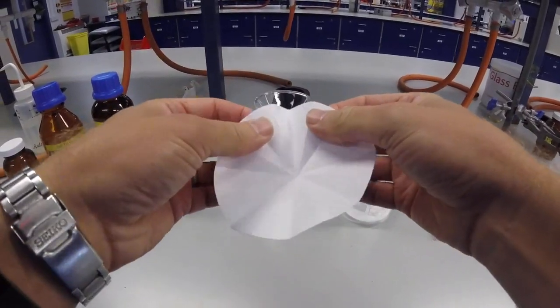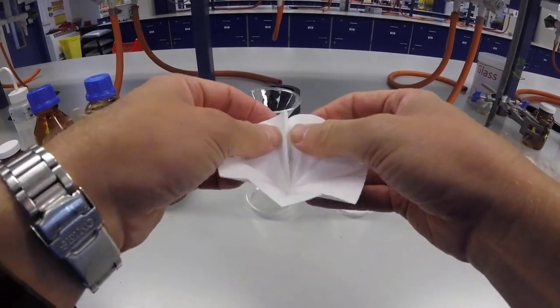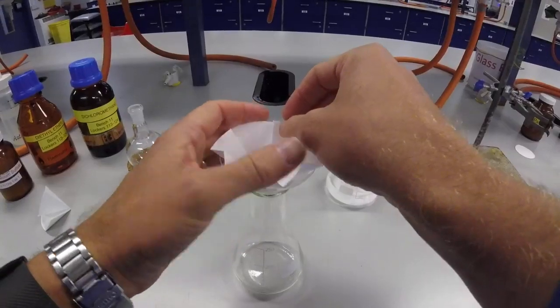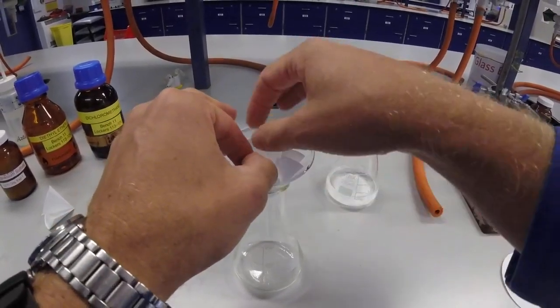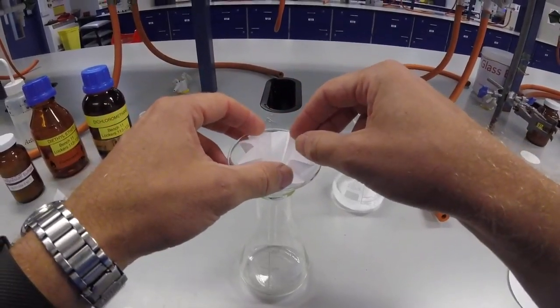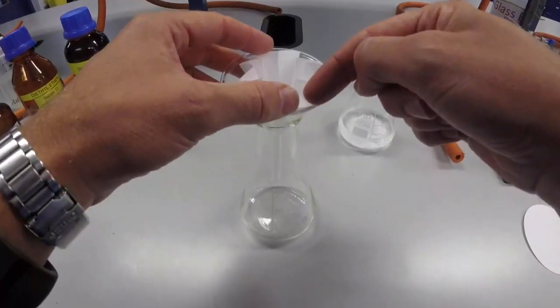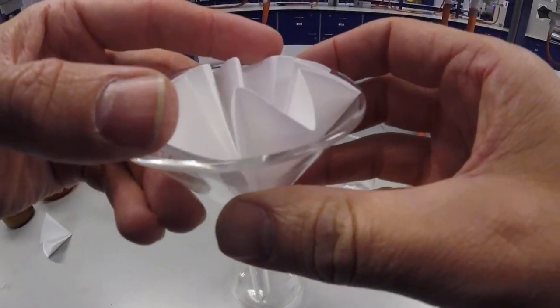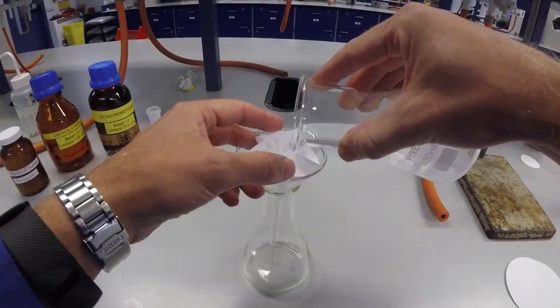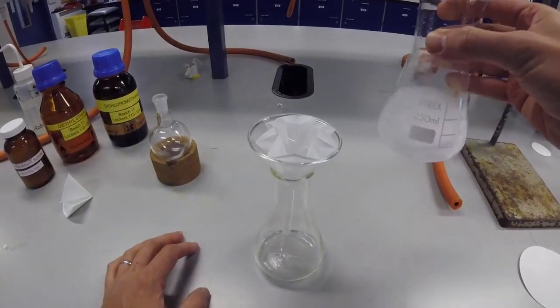And so now all our folds are going in opposite directions. And give them a crimp and they'll move in. And so now we can take it, place it in our filter, and now you see that it keeps those bits of the filter paper off the sides. Just need to hold it in place slightly until it's wet and filled with your hands. But now we're filtering from every single one of those folds. So each one of those bits, because it's being kept off the glass, it now is another surface for the solvent to move through. And so when you pour your liquid in, it will filter much faster, be much quicker and easier for you.